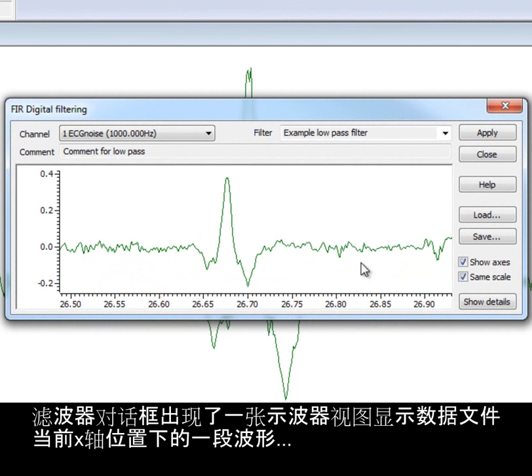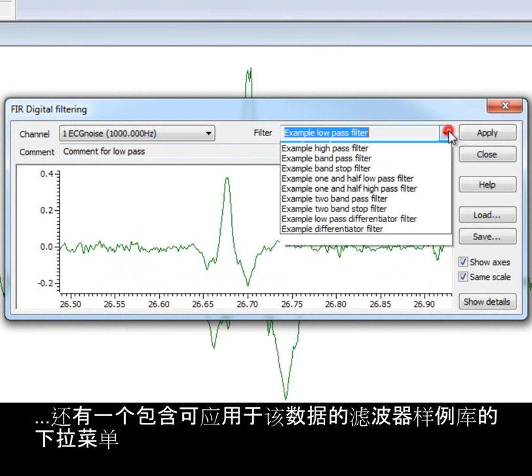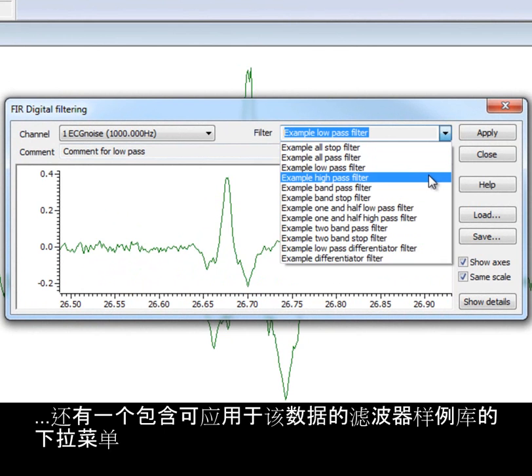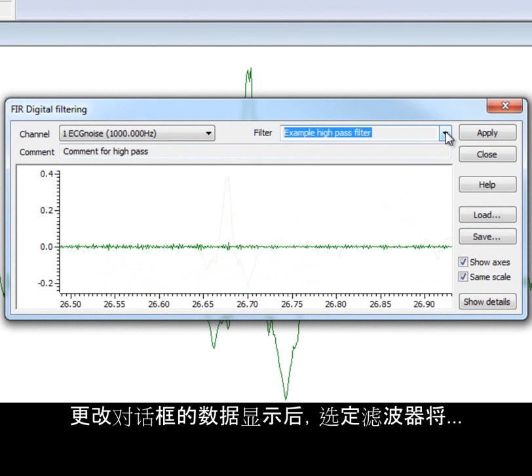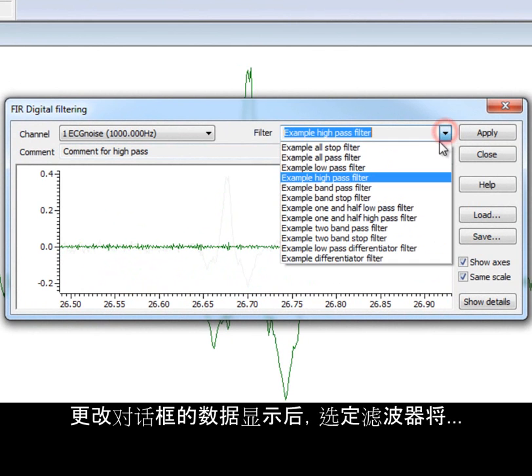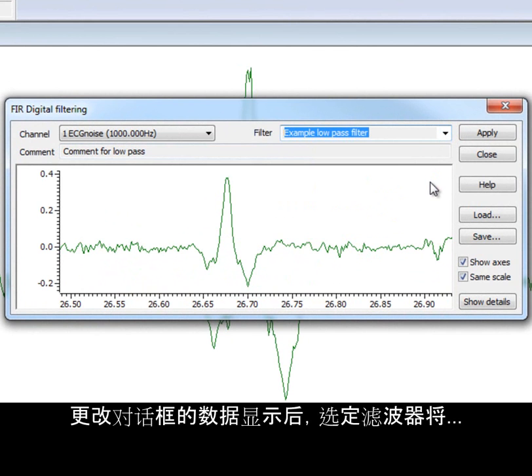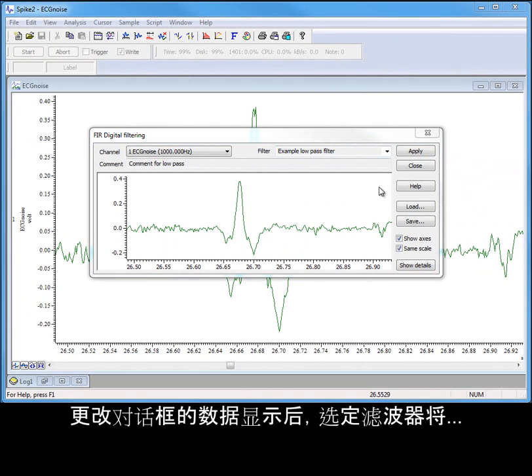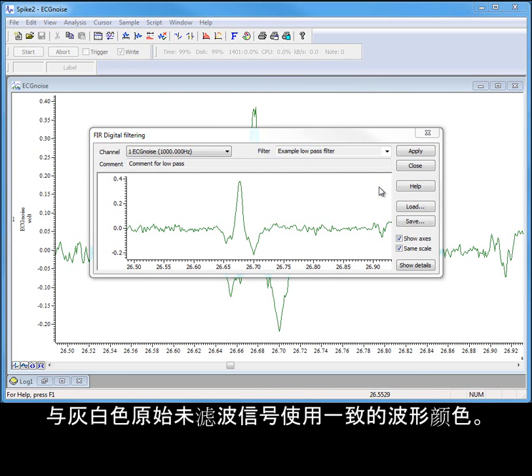The filter dialog displays an oscilloscope view showing a section of the waveform taken from the current x-axis position of the data file, along with a drop-down list that holds a filter bank of examples that can be applied to the data. The data display in the dialog changes to show the effects of the selected filter in the standard waveform color, with the original unfiltered data shown in grey.